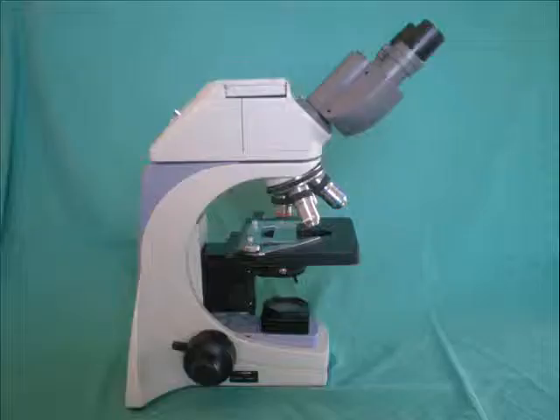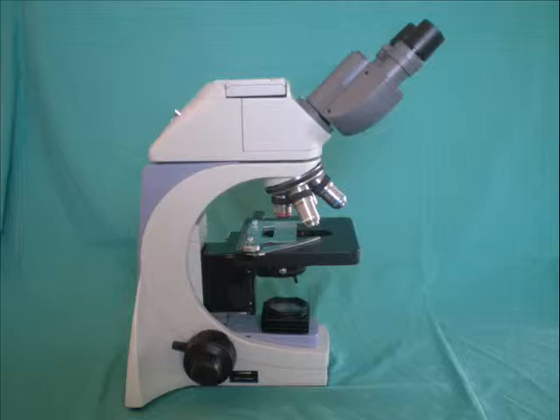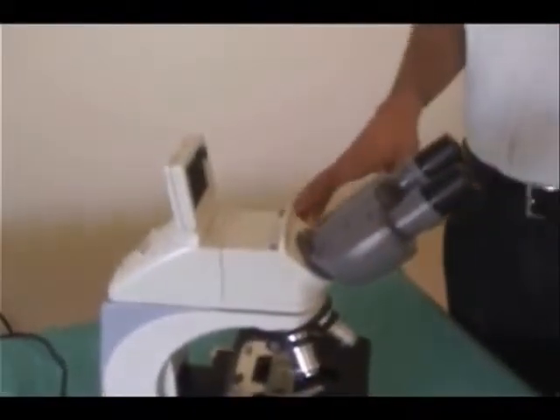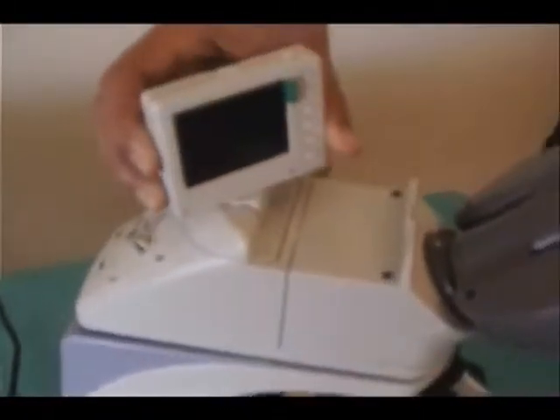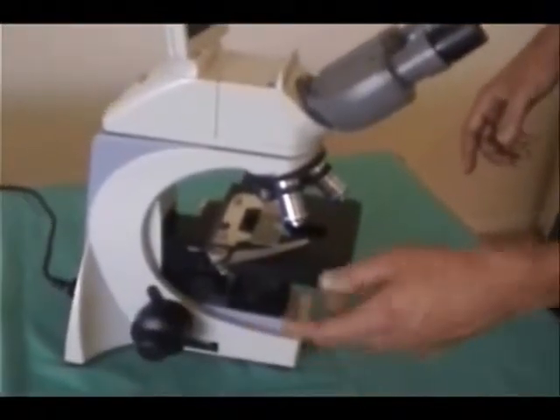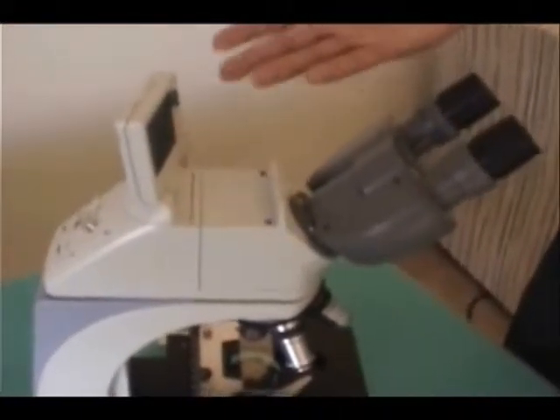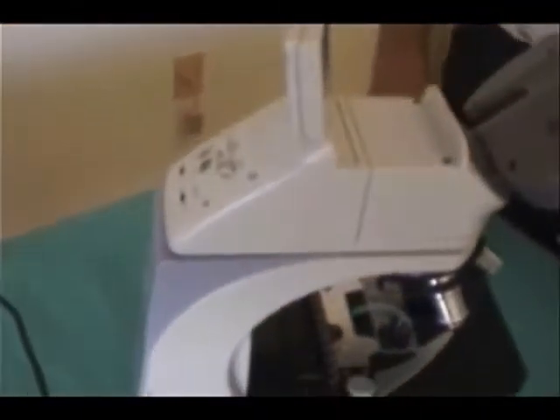Now, probably the best feature of this microscope is a high resolution LCD monitor, as you can see here. This monitor is great because if you're viewing a specimen, not only can you look at it through the binoculars, but the screen will also give you the ability to view it. And it has digital zoom. So you no longer have to adjust the fine or coarse adjustment. You can digitally zoom in and view the specimen. This is amazing as well if there's somebody next to you wanting to see what you're seeing at the same time.